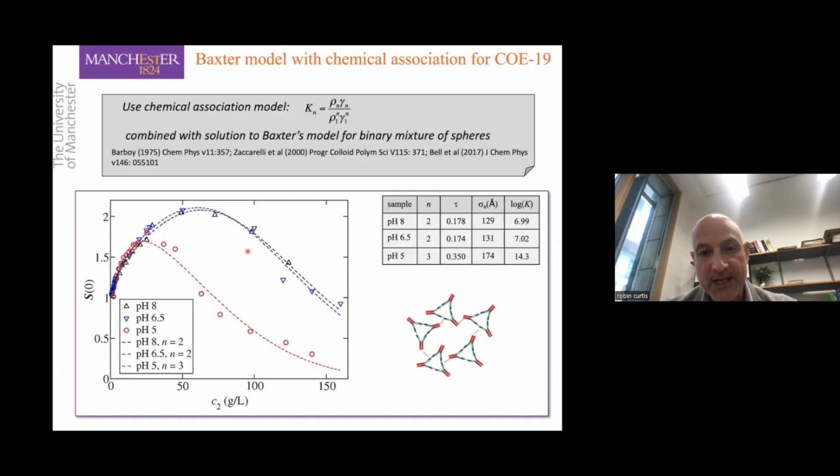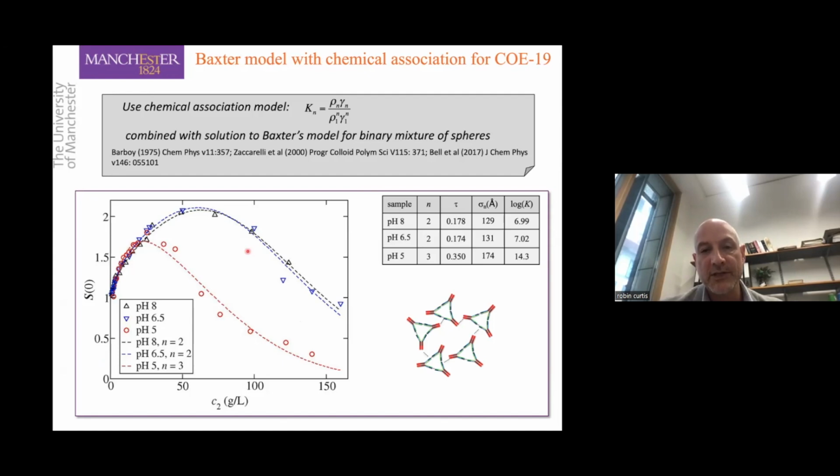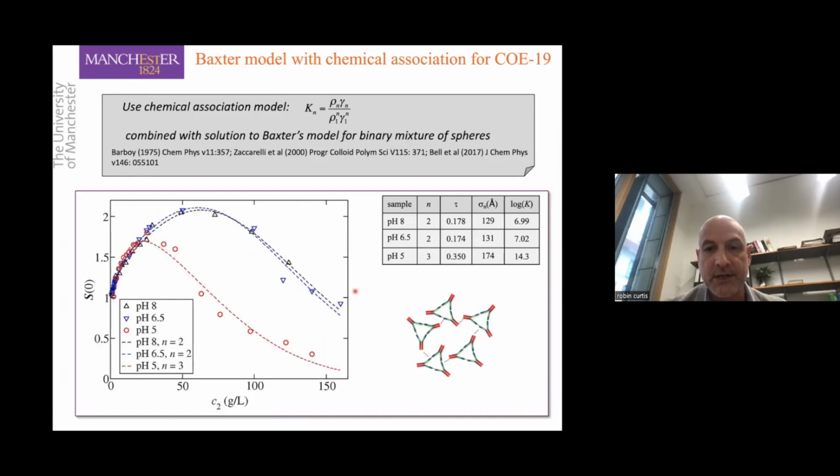And so then we asked the question, well, how do we know? If you just look at the virial coefficient data at low protein concentrations, you don't see any curvature in the plot of your structure factor. So if you just measured low concentration data, you would never know that you have an anisotropic interaction, other than from the fact that if you regress the tau to it, you'd find that the system will probably be thermodynamically unstable at relatively low protein concentrations.